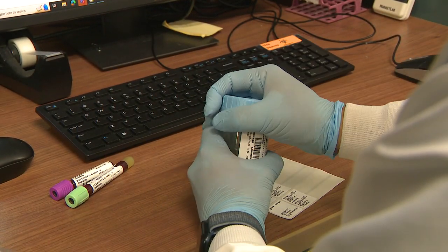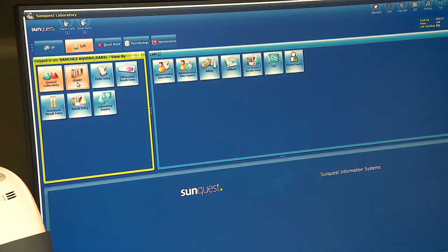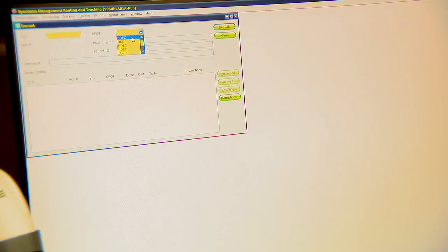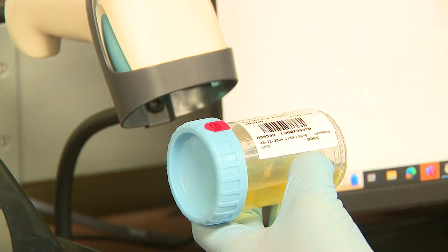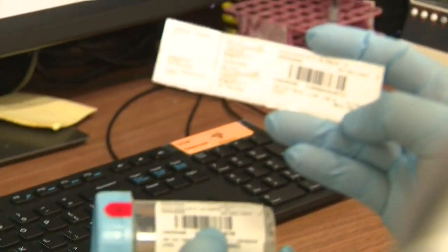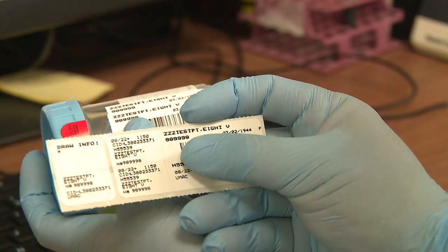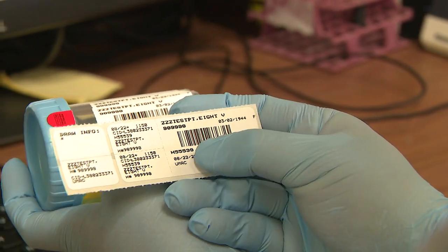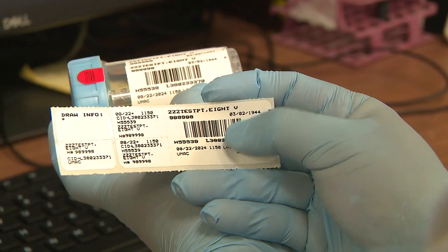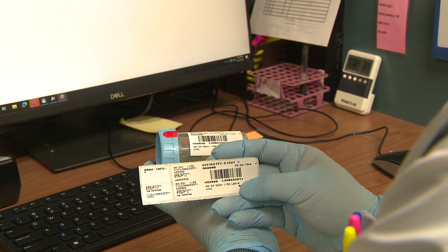Urines have to be further processed, so we're going to decant it and it's going to print off a decant label. In order to do that, go to smart processing decant. Our spot here at Bellevue is BDEC. We're going to scan our CID and hit processed. The system has printed off a decant, also known as a child label. So this is a parent label, and this is a child label. As you can see, the patient name, the MRN, and the date of birth all should match — with the exception of the actual barcode. This barcode ends in 70, this barcode ends in 71 — parent label and child label. This will make sense once we take it further down into the manuals area.